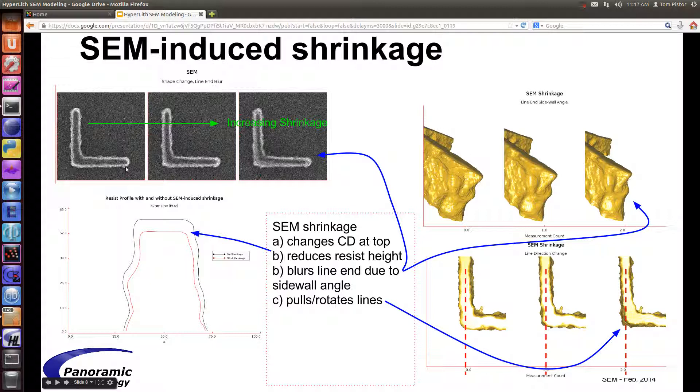Here it's vertical and horizontal. Then after you shrink it, the top is moving while the base is fixed. We've had a paper on this. There have been several papers about shrinkage in SEM. But if you're calibrating a resist and your SEM is giving you this, it's important to also account for that shrinkage in your simulation.